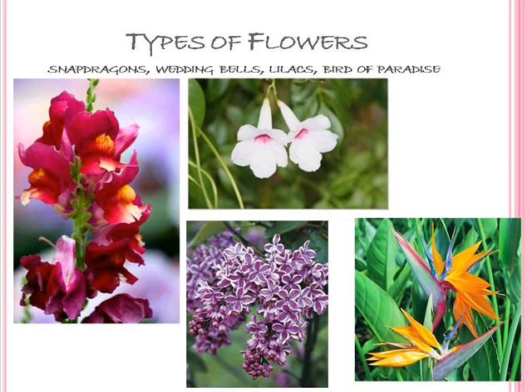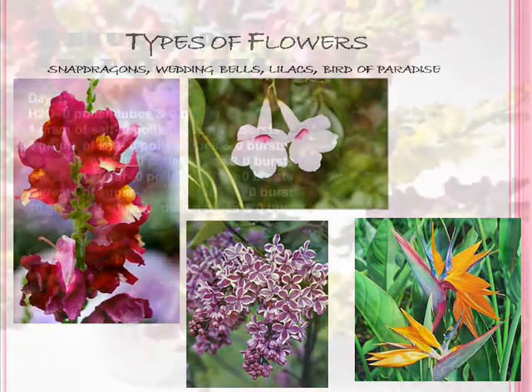And what we did, we took the pollen from each flower, put it in with one of the flasks, and then got a pipette, and put the mixture onto a slide, and then put it under the microscope, and analyzed the pollen tubes or the sperm bursting when we came back the next day.